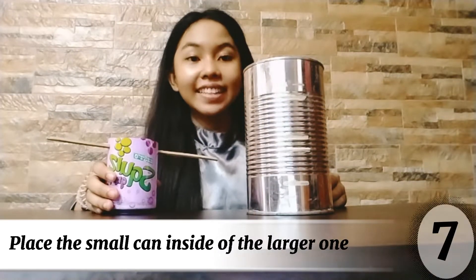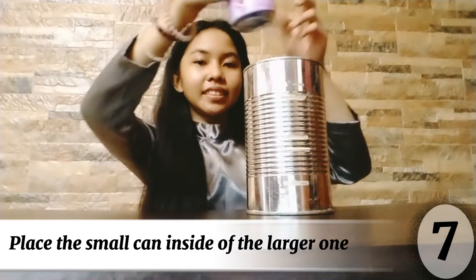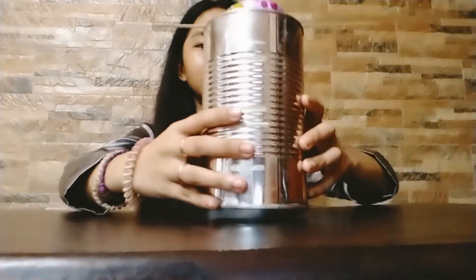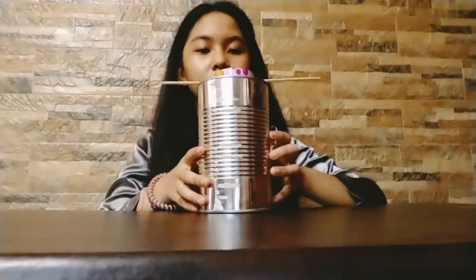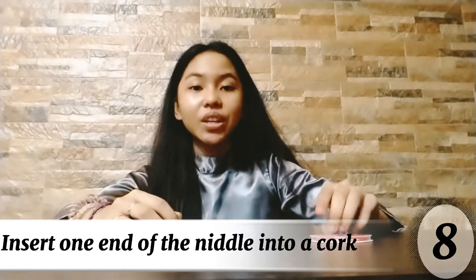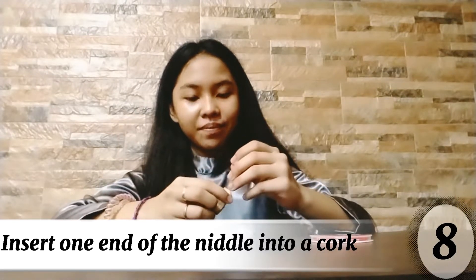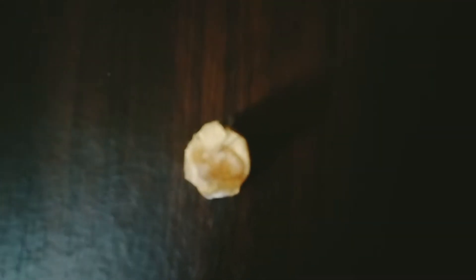Seventh, place the small can inside the larger can. The small metal can should rest securely inside the larger one, supported by the stick. Number eight, insert one end of the needle into a cork. It will be used to hold the food inside the calorimeter. Make sure it can stand upright with the needle sticking out.